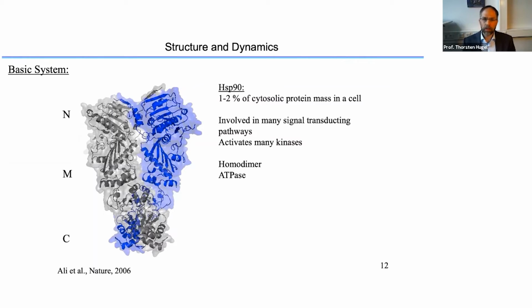And what do I mean with this? You heard a lot about structure determination from cryo-electron microscopy, before it was X-ray scattering, also computer simulations, and now deep learning. But more and more people notice that structure gets easier to get, that dynamics is in principle the key, and that you have to bring these two things together.